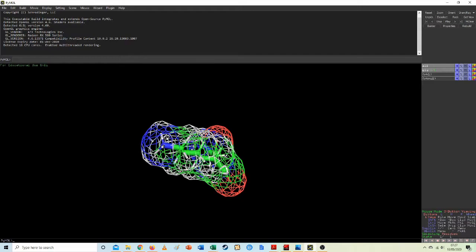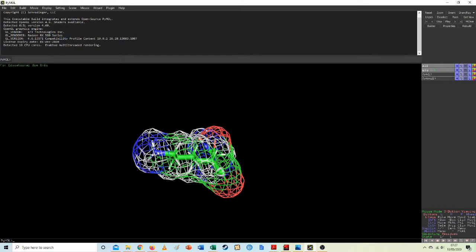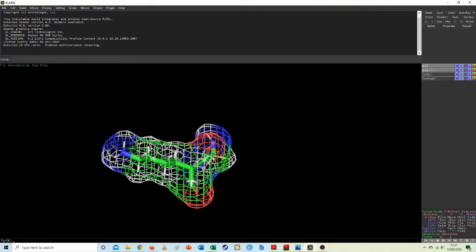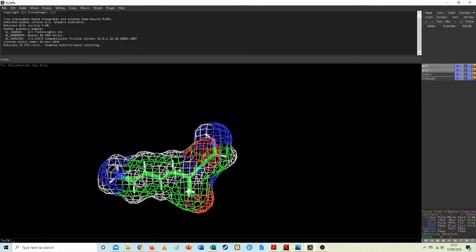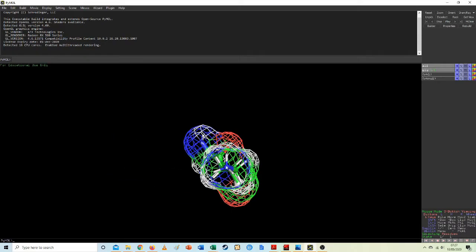That's got a positive charge, so this is our basic one that we had last time, and you can see that big long carbon chain that hopefully you saw in the Molly mod. Now that's going to be non-charged for the most part, and this bit up here is going to have a charge.